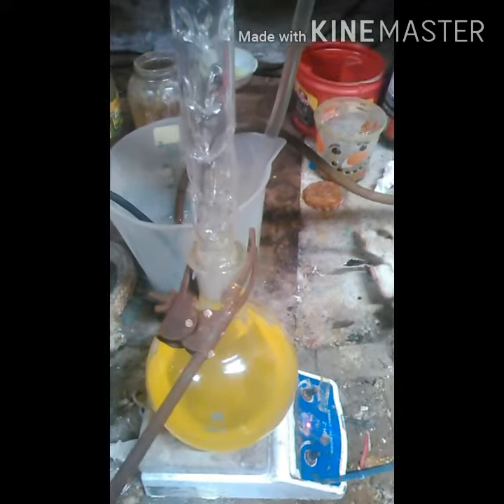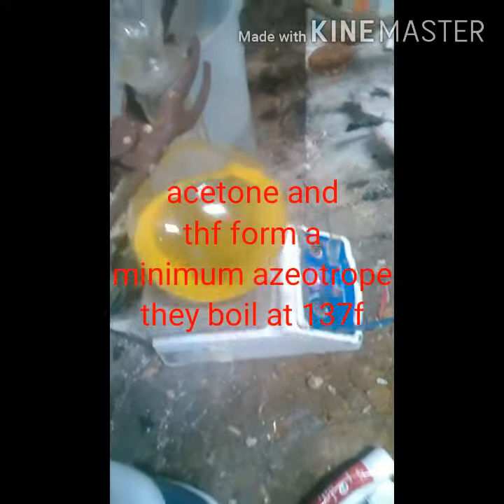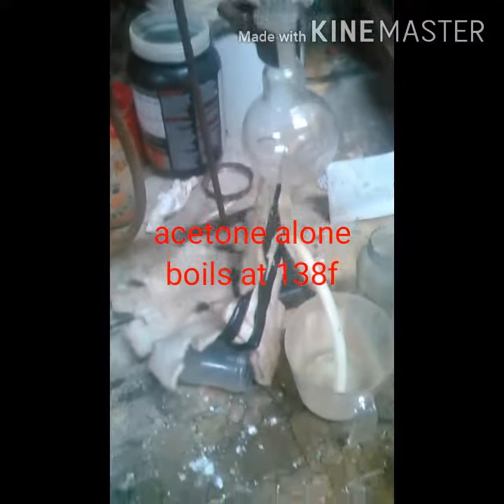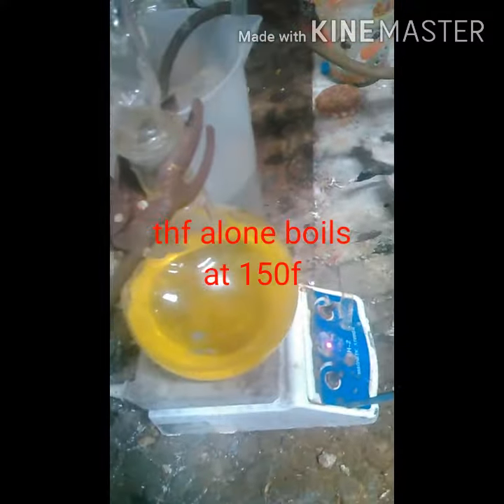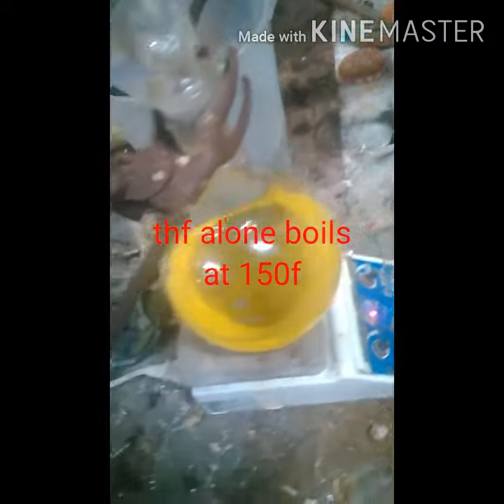I'll show you when I get to the boiling point. I just broke 140 degrees Fahrenheit and I've got nothing coming over, so I'm definitely in the clear because my boiling temperature for THF will be 150. I'm almost there, so it definitely works this way. Happy till the next one, guys!